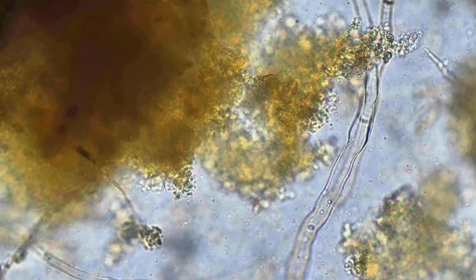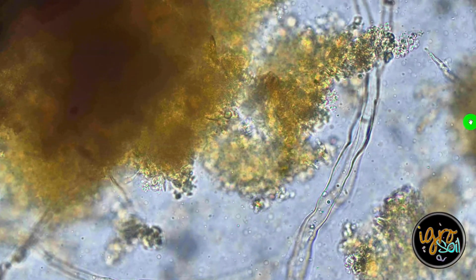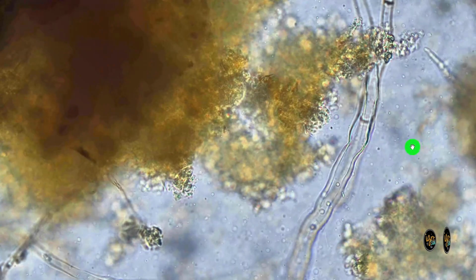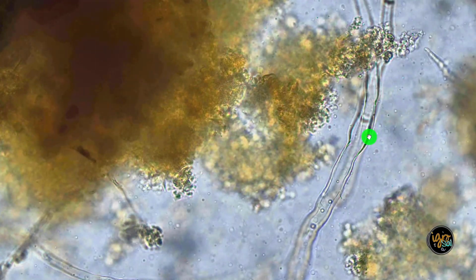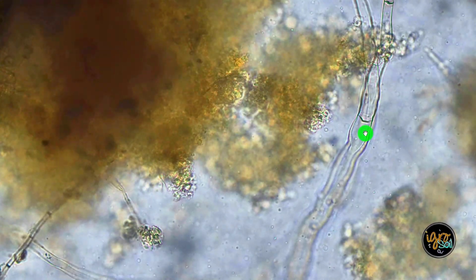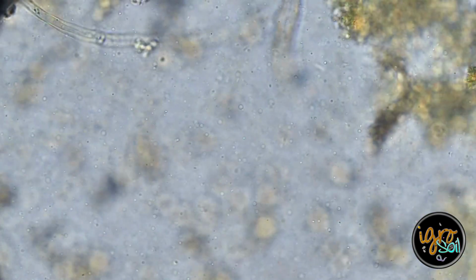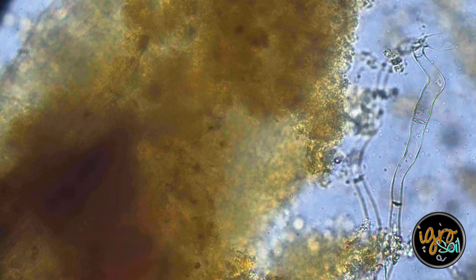This is very thick. And you see the inconsistency in the walls here? Let me see if I can get a better shot of that. You see, it bulges out. It's not even. And again, hyphae is actually even. So could this be some type of actinomycete, actinobacteria? You see up here, they're not even. They're wide. If it's flaring out here, that is not hyphae. I would not call that hyphae from everything that I've learned. I'm gonna dump back to 100.